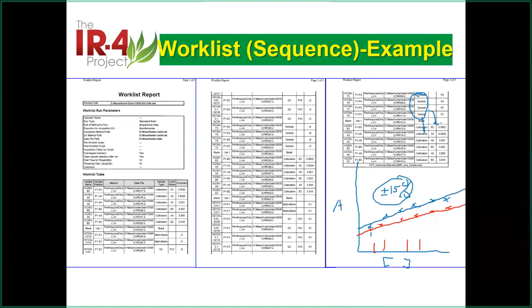This happens all the time because your instrument is getting dirtier and dirtier. The response will go low. But this kind of shape is always there. And another good question is it always depends on the last point, because the last point is always high. If it moves a little bit, your curve will change significantly. So you need to change this accordingly. So you do need to have this.